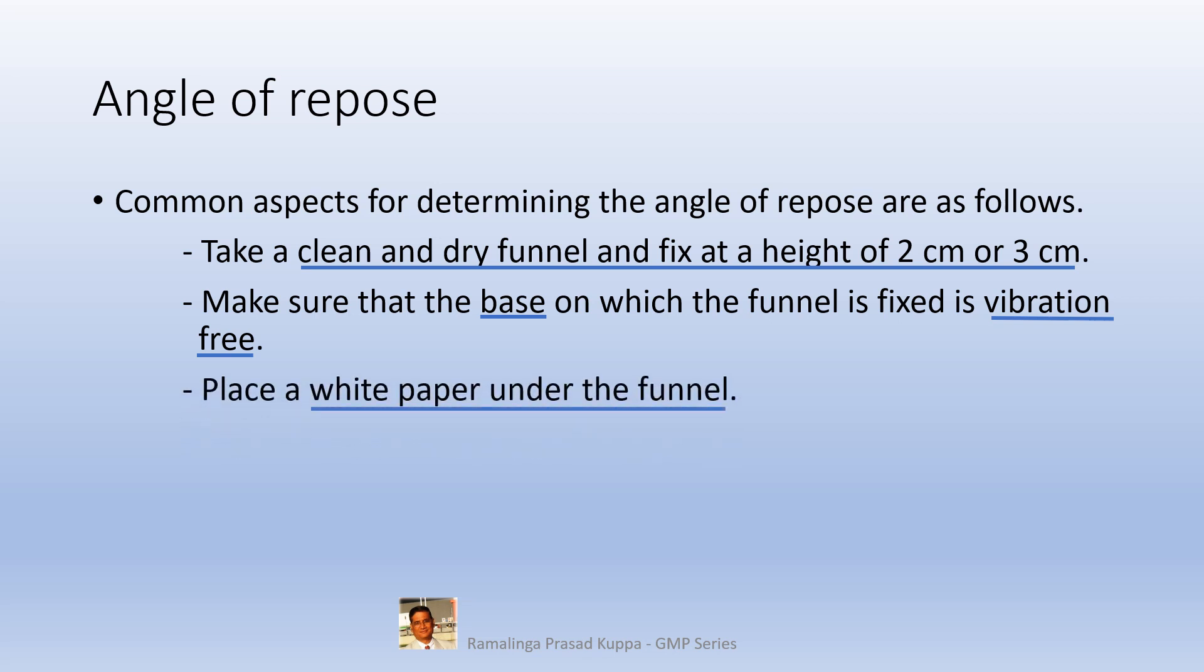Place a white paper under the funnel. Make sure that there are no air currents to disturb the paper from the base. Take the sample and gently break the lumps, if any, to make it free flowing. This is to ensure that the entire sample is free flowing without any lumps. Lumps can hinder the flow through the funnel.